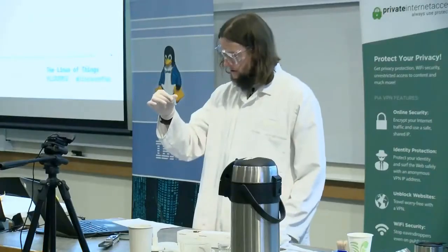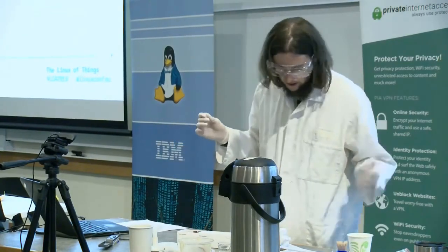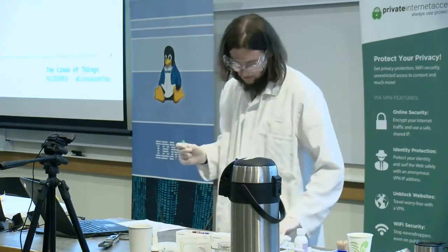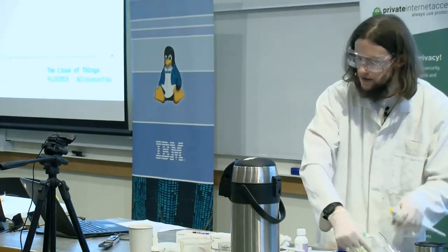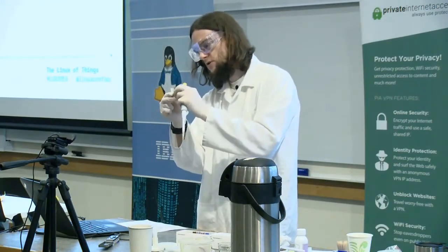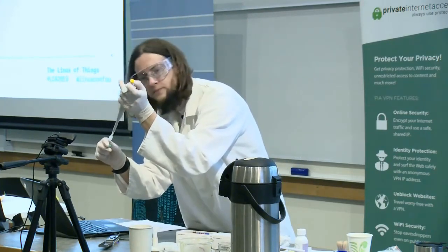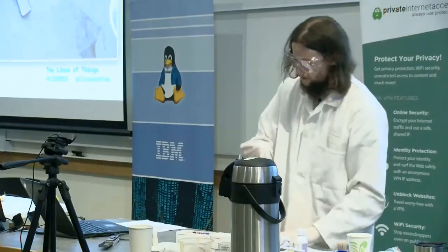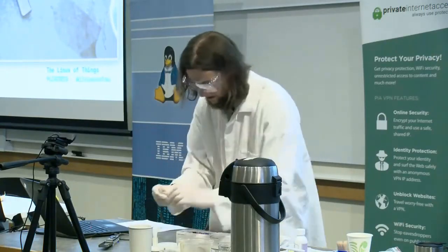Okay, now that the fragmentation mix is inactivated, I can add my rapid adapter primer, which is in here. And for this, I need 1 microliter. That's a very tiny amount. I'm not actually sure if I'm going to be able to get 1 microliter, so I'll probably try and get a little bit more than 1. This needs to rest for about 5 minutes. I will spin it down again.